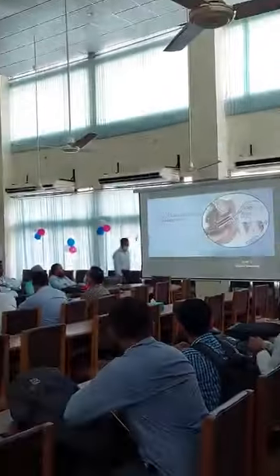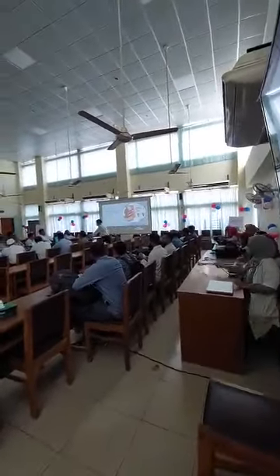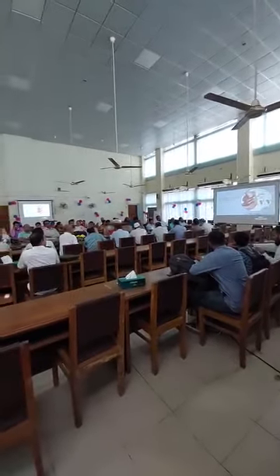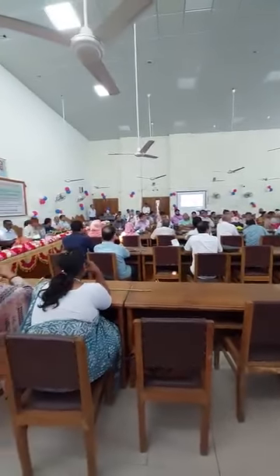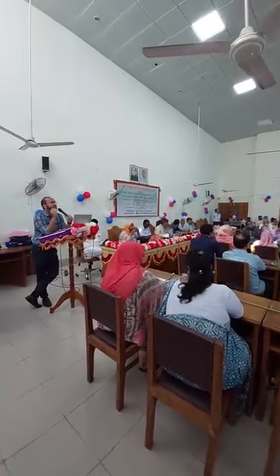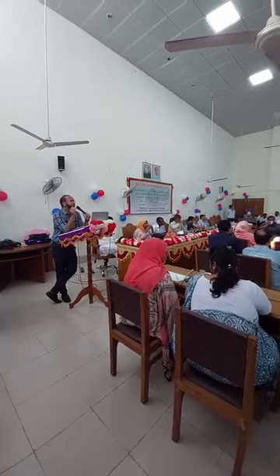This is the Pap smear, the cervical screening test. This is operator dependent, because the better the sample collection, the better the report. So we collect the Pap smear with an Ayre spatula through 360 degrees from the transformation zone and immediately spread it on the slide, fixed in 95% ethyl alcohol.